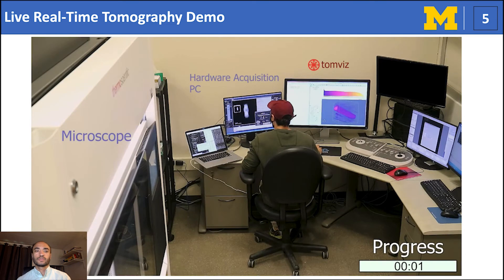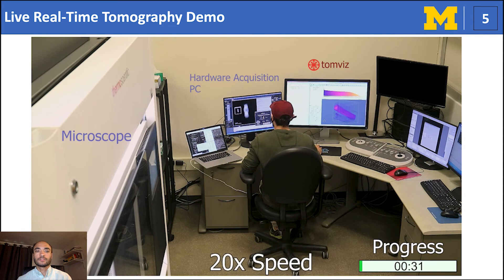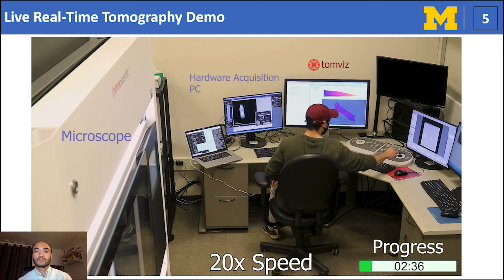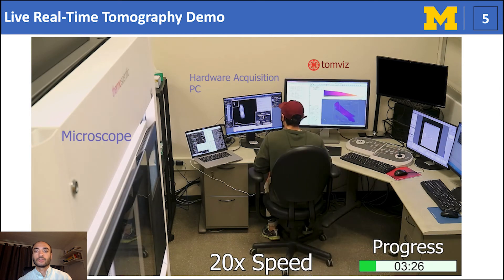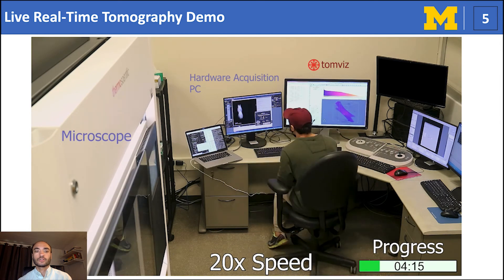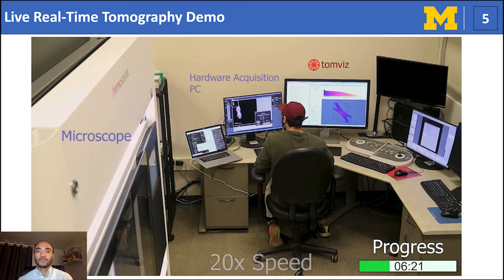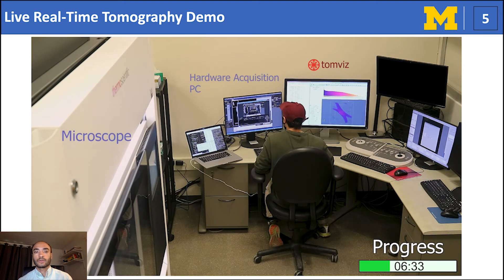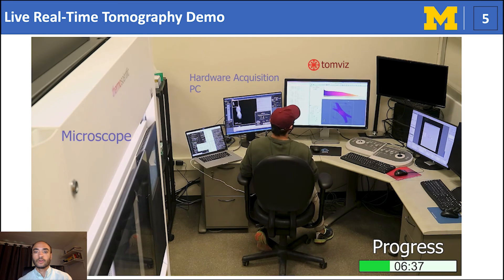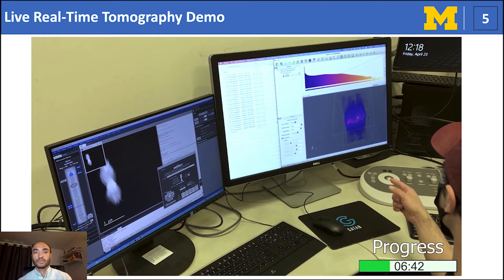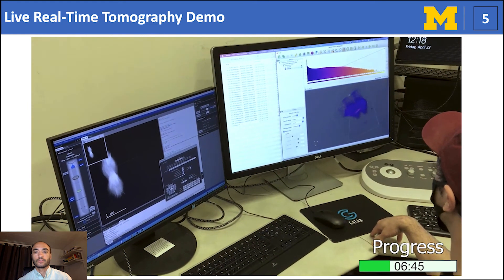We now demonstrate a video of the real-time tomographic experiment occurring as I conduct the process on the cadmium cysteine nanoparticle. Here, I collected about 70 projections across a plus or minus 70 tilt range with 2 degree tilt increments, and reconstructed the volume with SIRT, the simultaneous iterative reconstruction technique. There are three computers present in the microscope room. First, my laptop on the left, which is running TomViz, the center controls the microscope, and the large monitor is displaying the reconstruction. I am freely able to rotate and visualize the intermediate product as the experiment proceeds.